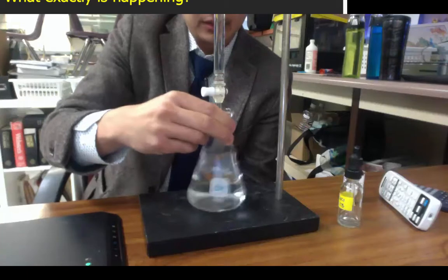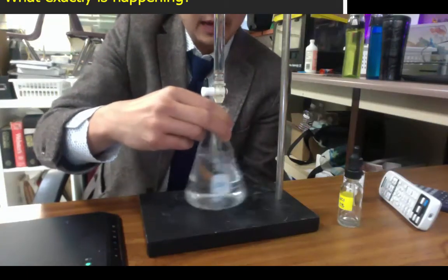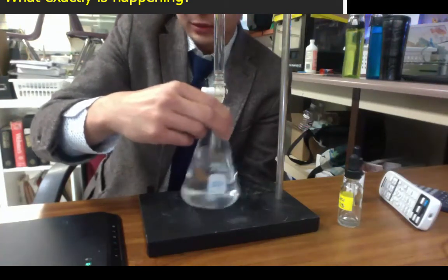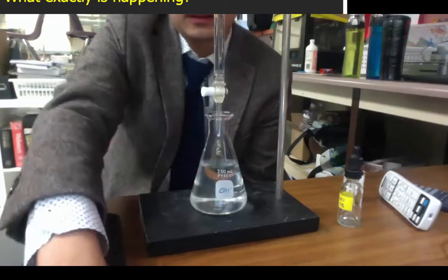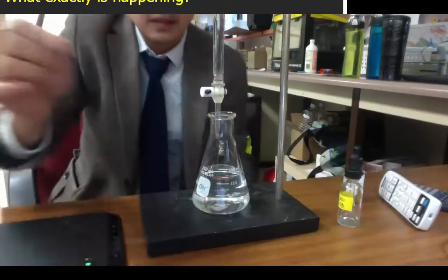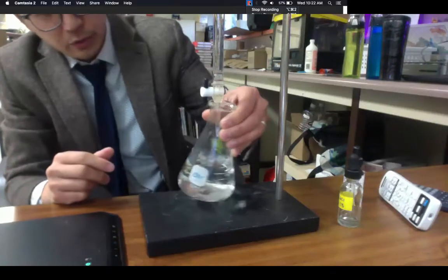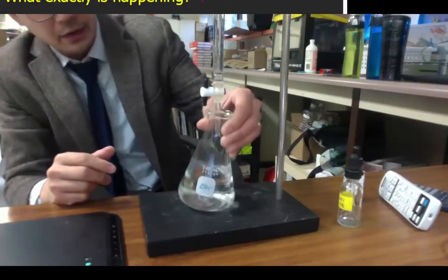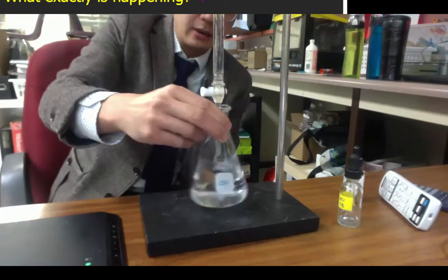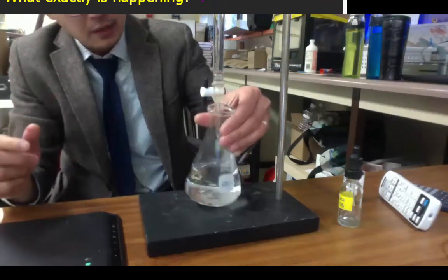Okay, let me continue doing this, and it's still going. It's very slow. These burettes are very slow at dispensing because you want it to be drop by drop for accuracy. So I'm going to keep swirling this, and hopefully it'll change colors soon. Okay, so as I dispense more, you can see that it's slowly showing some hints of pink in here, and I'm just going to keep going until I reach that equivalence point. So right now I still have not reached that point.